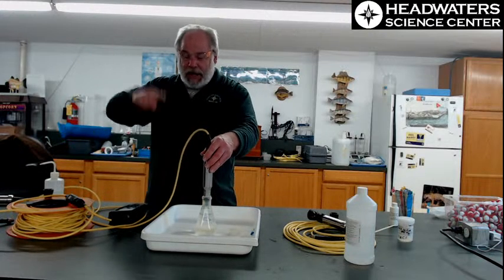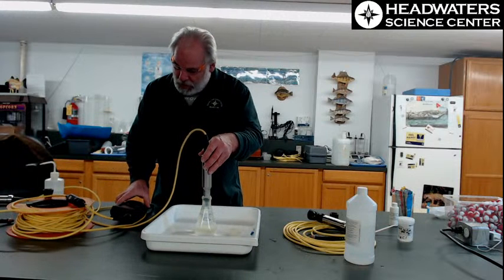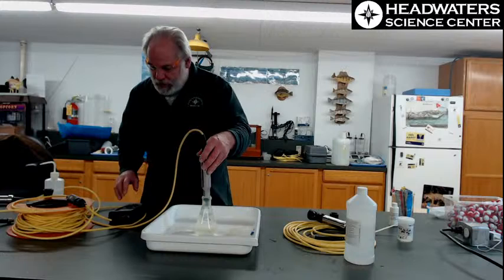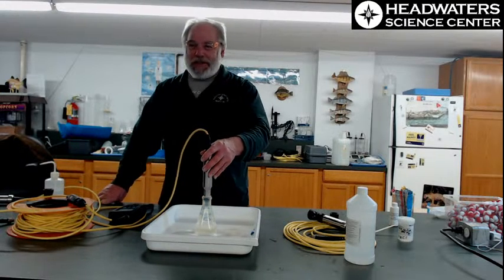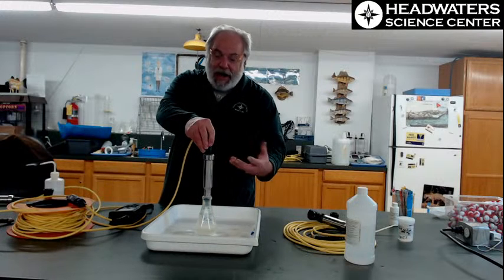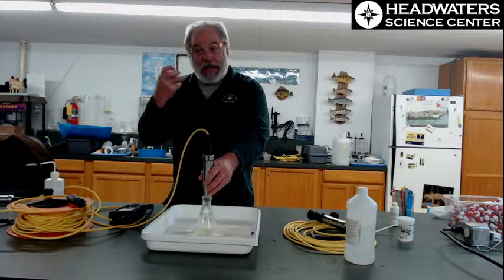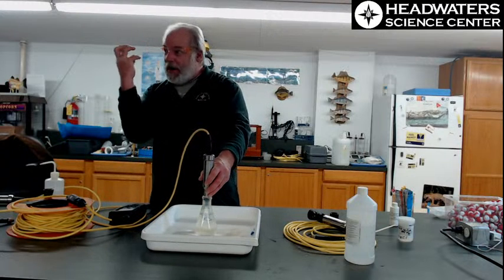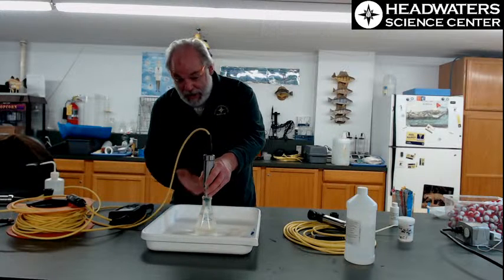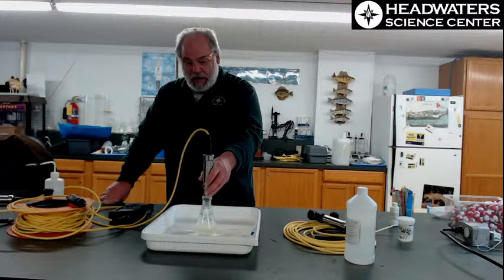So from a logical point of view, we get that going, and we have more time now to explain why I like this one the best. Right now it's trying to find that 100% saturation in air, which is actually a lot harder to do, to find the actual saturation in the air than it is in a liquid, because this meter is actually designed to find oxygen in liquid.